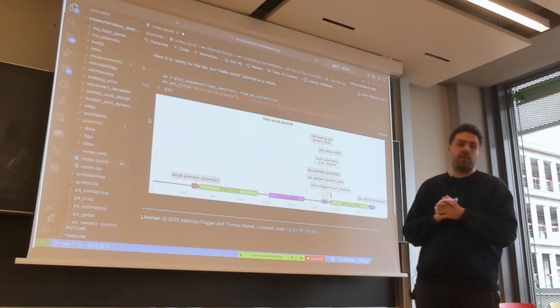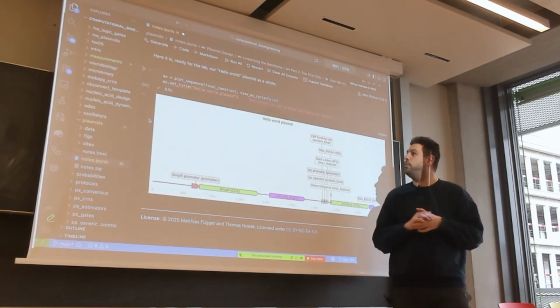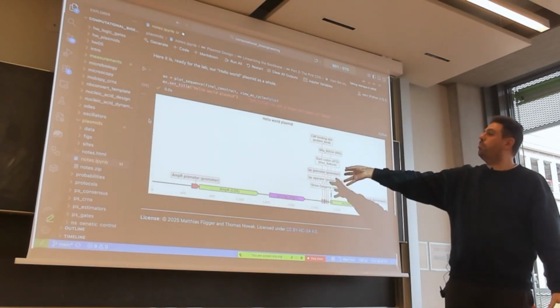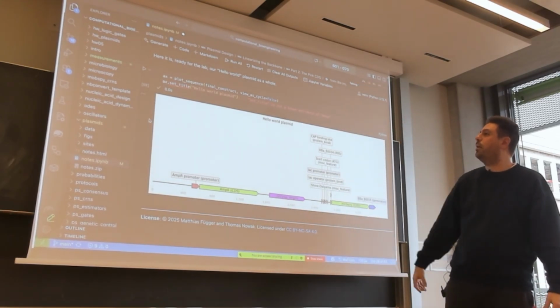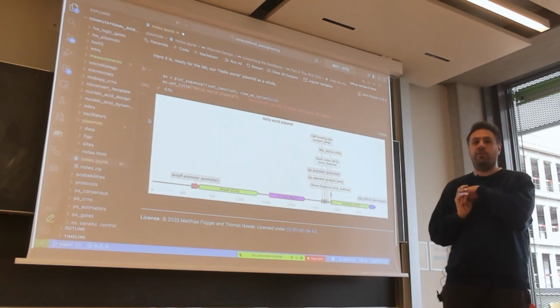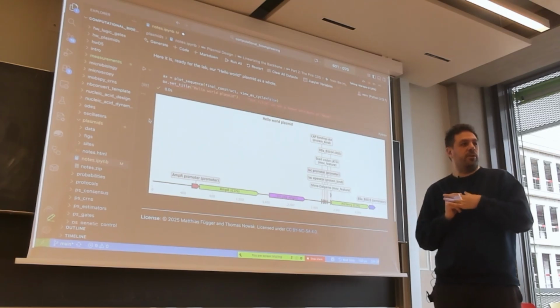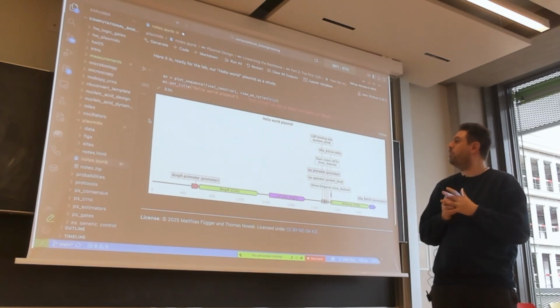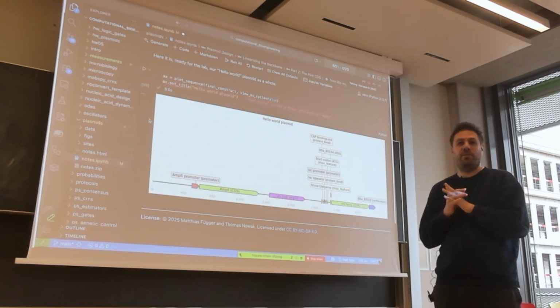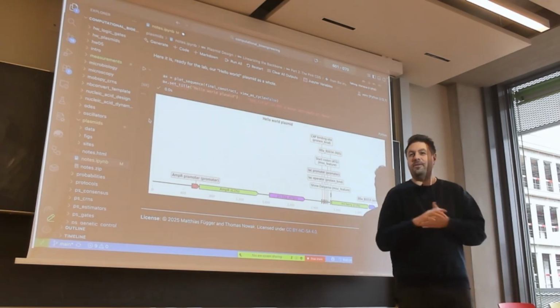This brings me to the end of the lecture. What we have seen, and I think this is the big takeaway, is a pure Python notebook that generates, verifies and simulates a Hello World program in DNA. I hope you liked it. You have all the constructs here. You can go to the lab and try that out. Thank you.